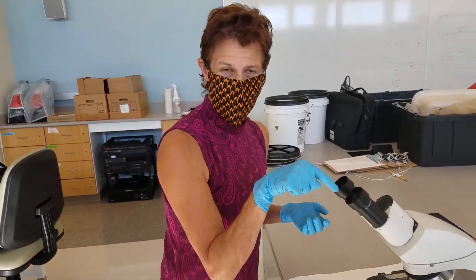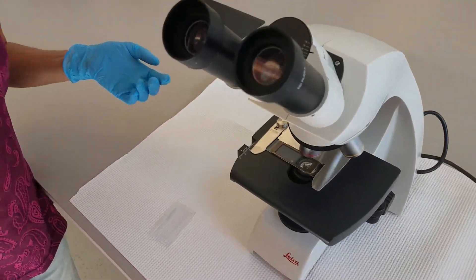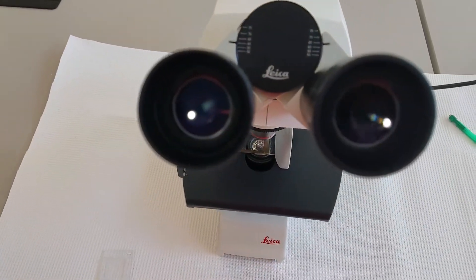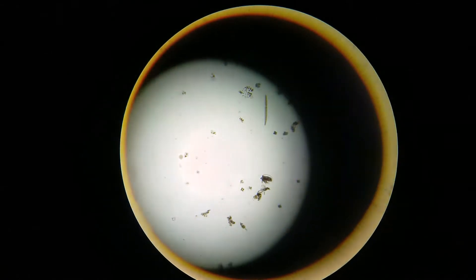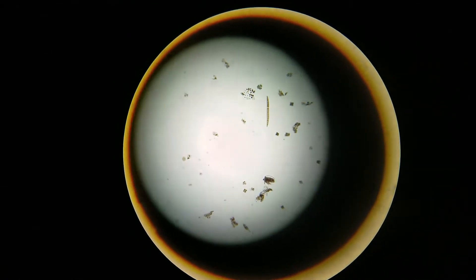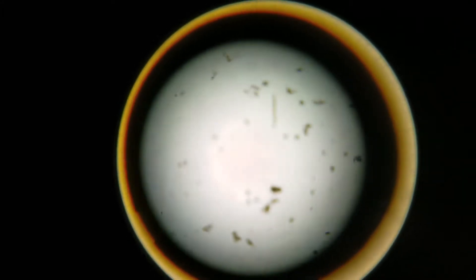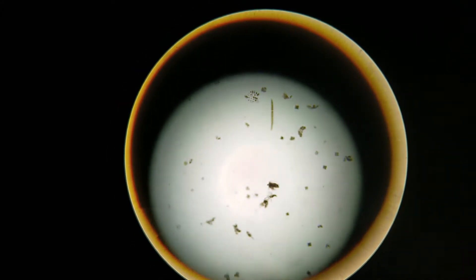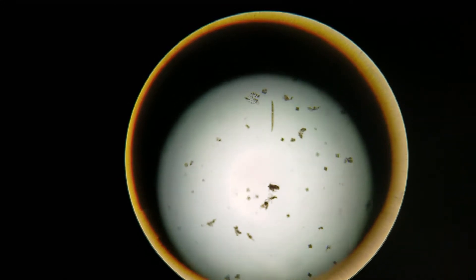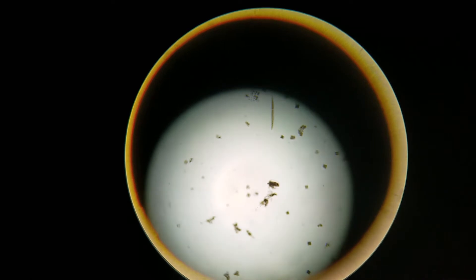Maybe you can see something through the oculars. It's not zoomed in enough for me to really ID what's in there, but you can see that there are some small pieces of organic matter that are in focus. That's what we're aiming for — usually you have to go all the way down on the 4X, but you start out with the ocular all the way up.